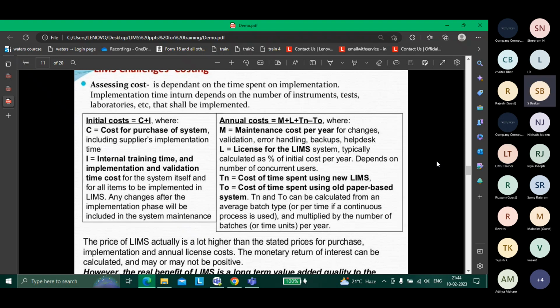So you are talking about Labware LIMS. Yes, but we'll talk about some terms, right? Test, analysis, product, which is common to all LIMS. Where we have to go and edit the samples, and where we have to give the comments, everything, right? We'll go far above that. We'll go to sample login template. Samples are at a very low level, right? Sample user template. At a higher level, we have LIMS basic code. We have query writing. Those are high-level things.